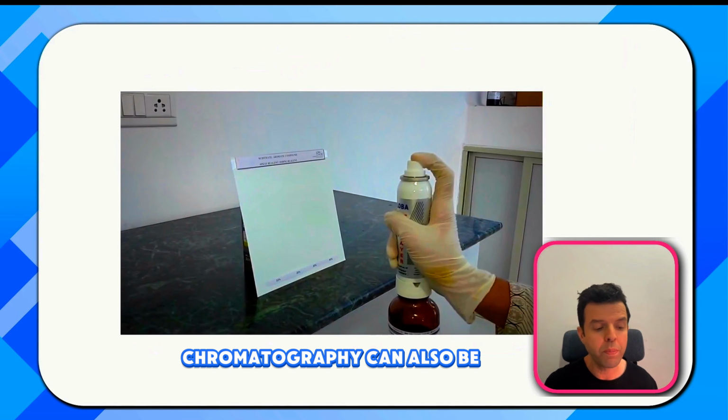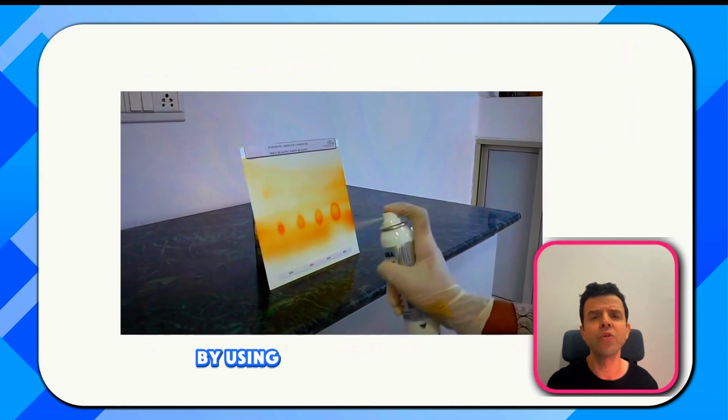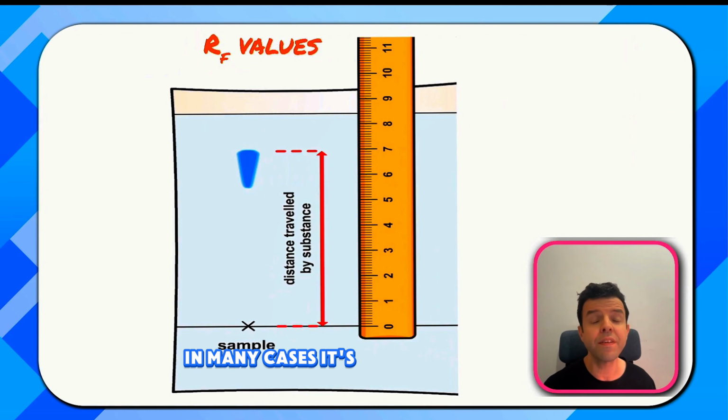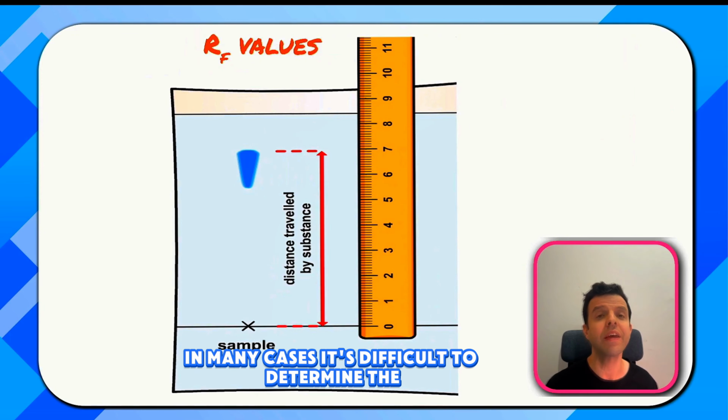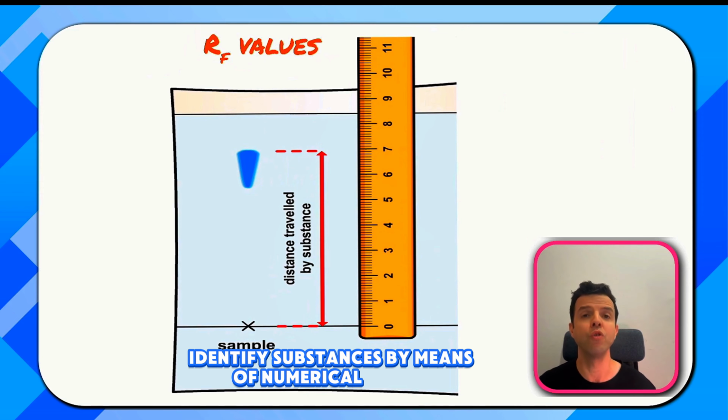Chromatography can also be used to identify colorless substances by using a special chemical known as a locating agent. With the help of the locating agent, we can identify materials that are colorless. In many cases, it's difficult to determine the substance by means of just its color. That's why there is one way we can actually identify substances by means of numerical values.